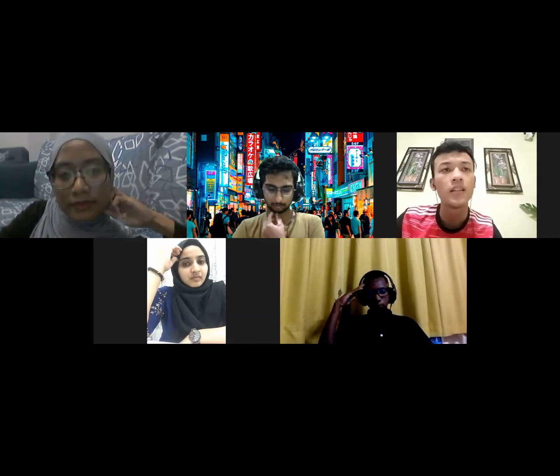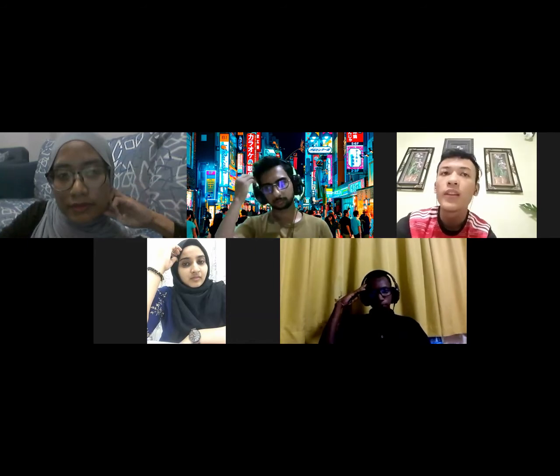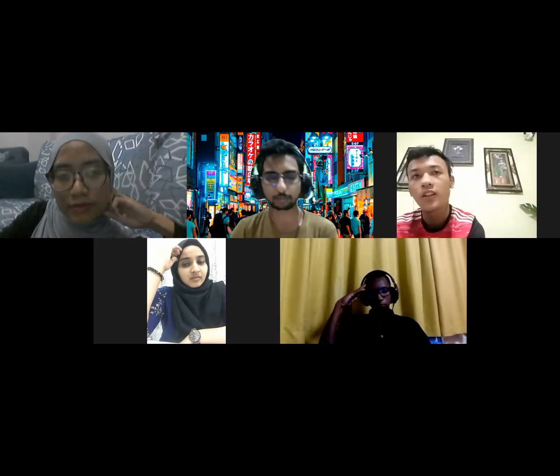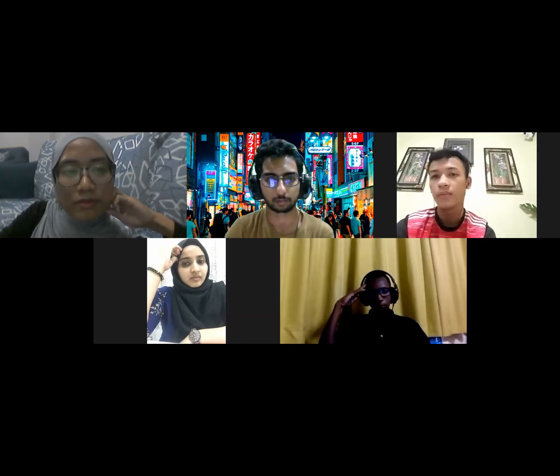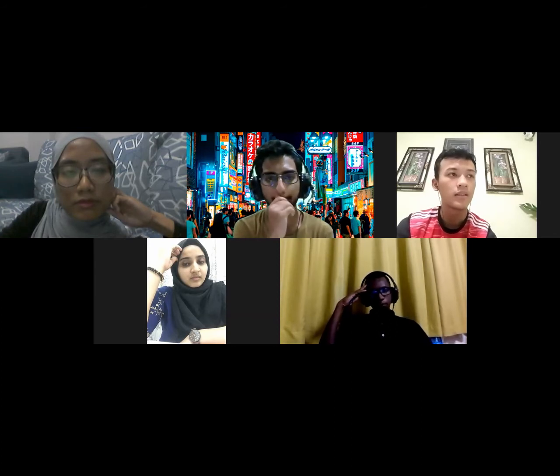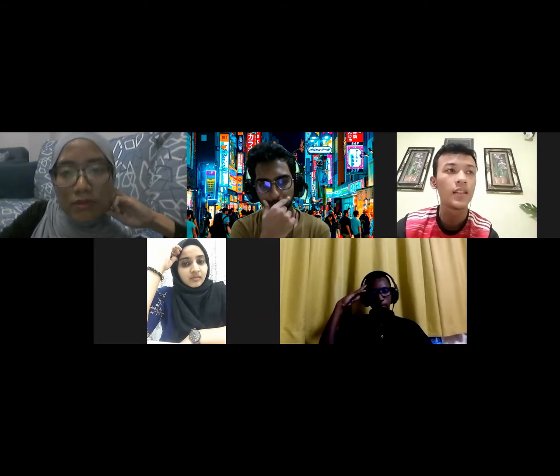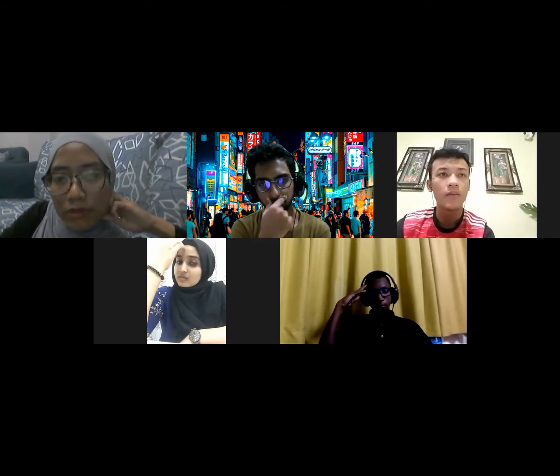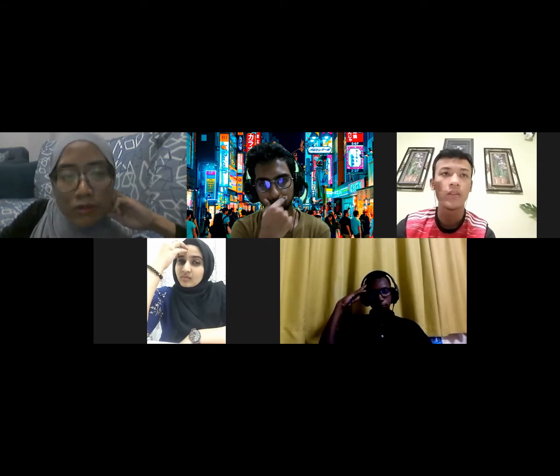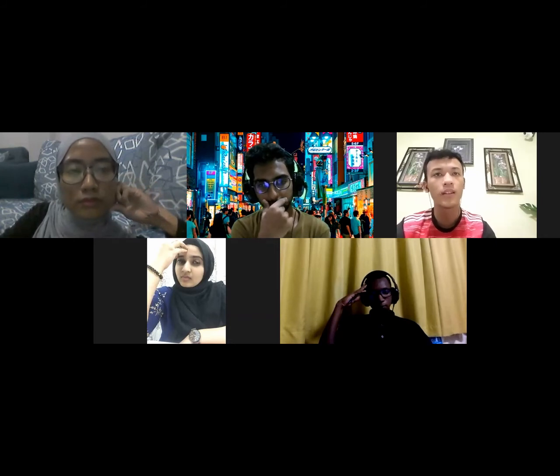Okay. And the GC is 55. The self-complementary is 3 and self-3 complementary is 3 also. For the reverse primer, it is GGAGGTCGTGAATAGGGGTA. The TM is 57, GC 55, self-complementary 2, self-3 complementary 2.